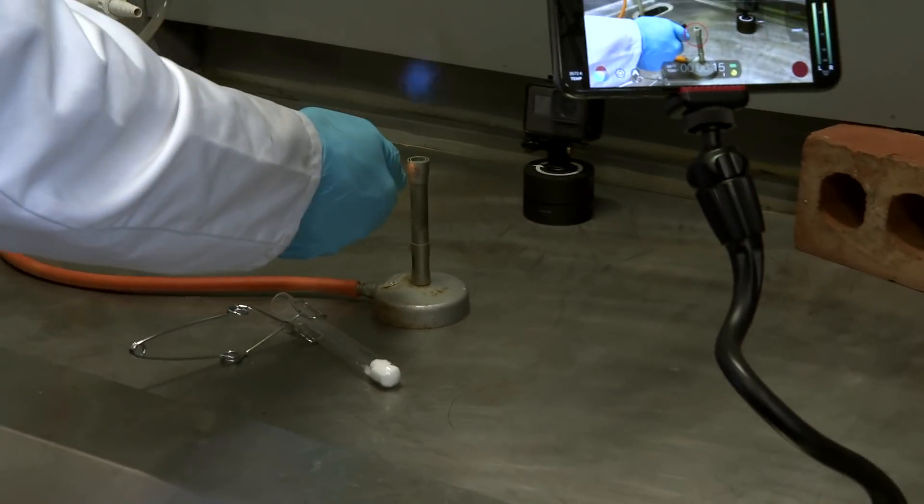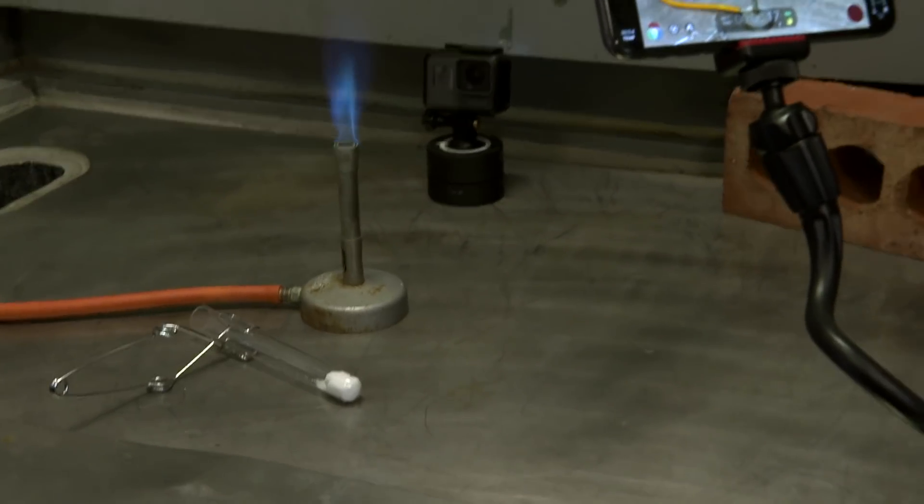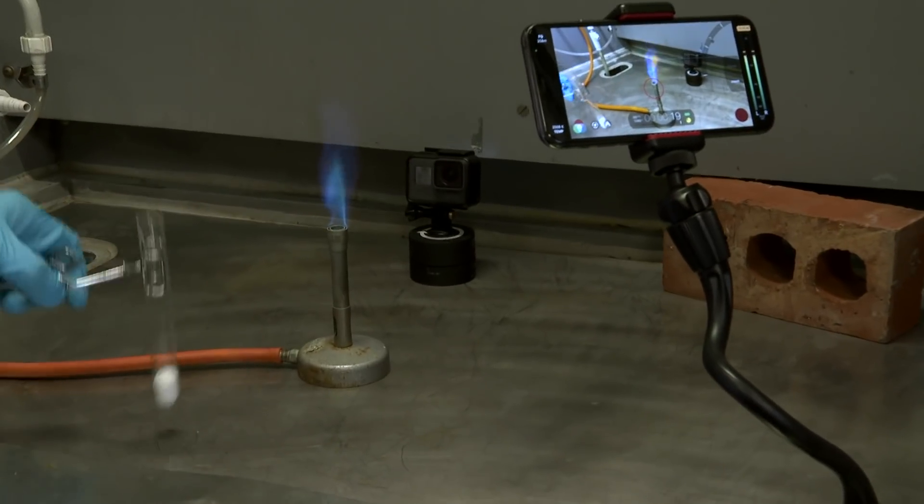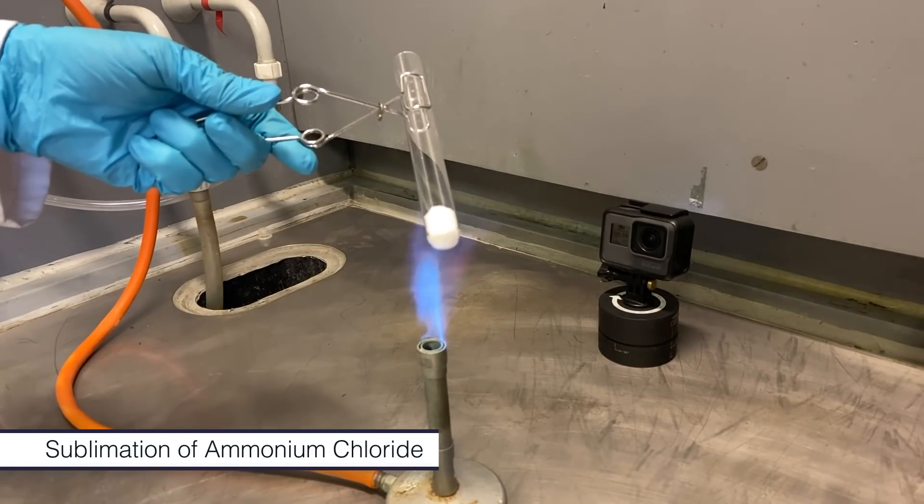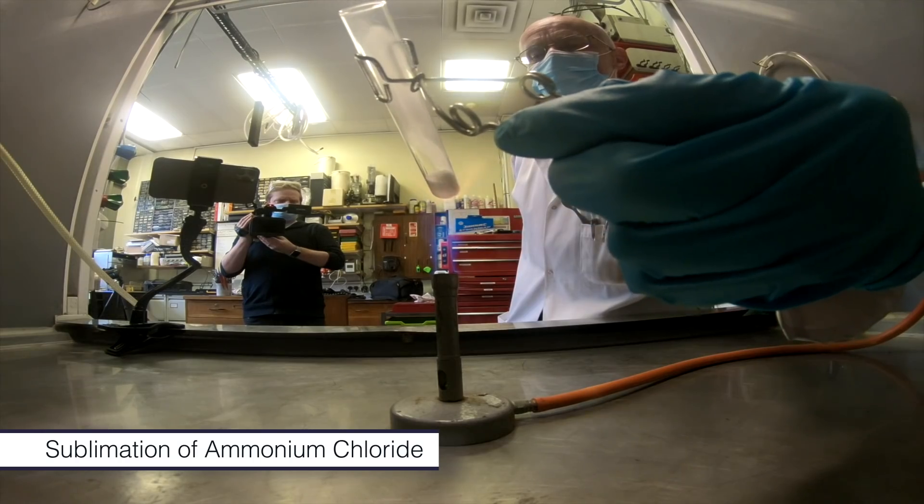Let's begin with ammonium chloride and what happens when you heat it. Most things when you heat them either melt or occasionally decompose, but ammonium chloride is unusual in that when you heat it, it undergoes what is called sublimation—turns into a gas which then goes straight back to the solid.